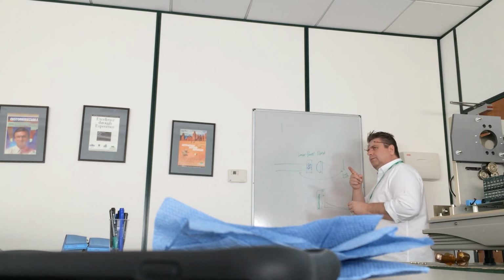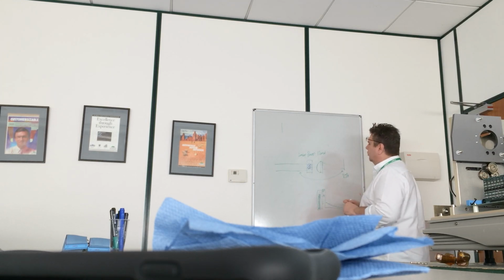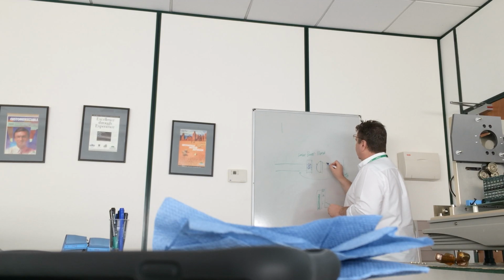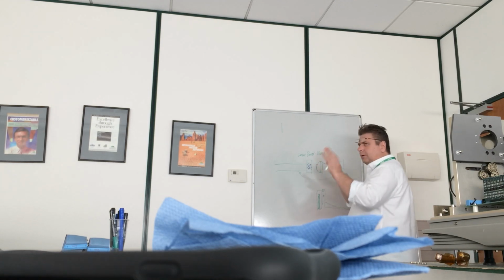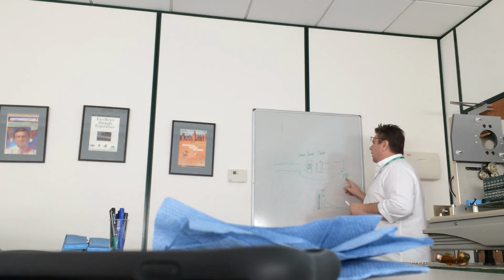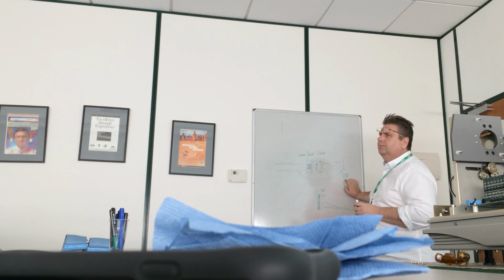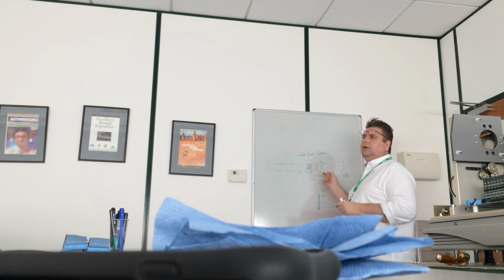So if I put some sample in there now, two things happen here. Obviously, the sample's going to block some light, so we're going to see this scattered light going up here. Blah blah blah. Yeah, we know all about laser diffraction. Am I still getting 90% laser transmission? I think it's going lower. It's going lower, definitely, absolutely, yeah, because the sample's going to block the laser transmission out.